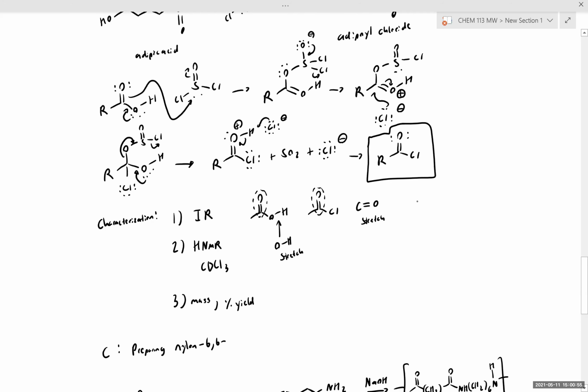What we'll notice is that, for example, if our adipoyl chloride shows up here and then our adipic acid shows here, the fact that we see a shift in the IR absorbance and the IR wave number value for our CO stretch, we're monitoring this CO stretch via IR to verify that the reaction has gone to completion.